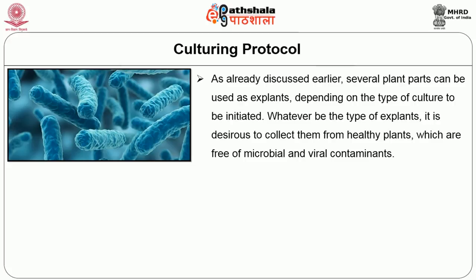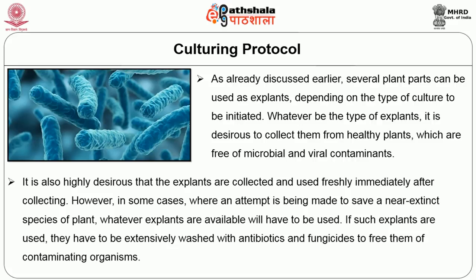Whatever be the type of explants, it is desirous to collect them from healthy plants which are free of microbial and viral contaminants. It is also highly desirous that the explants are collected and used freshly immediately after collecting. However, in some cases, where an attempt is being made to save a near extinct species of plant, whatever explants are available will have to be used.